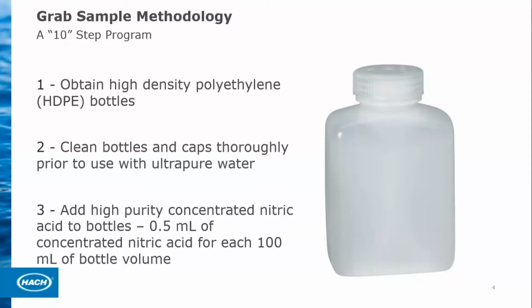Then what you do is you're going to add some concentrated nitric. And again, using high purity, you're going to add that in the amounts listed. What that's going to do is pretty much clean the bottle and prevent it from getting any further contamination.